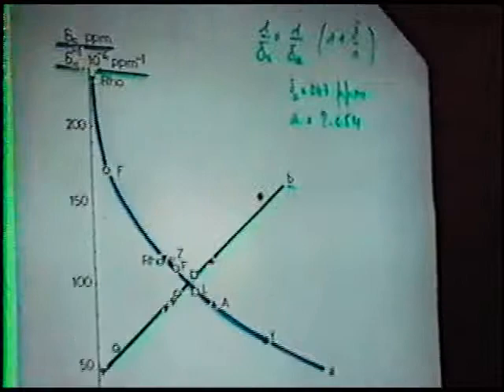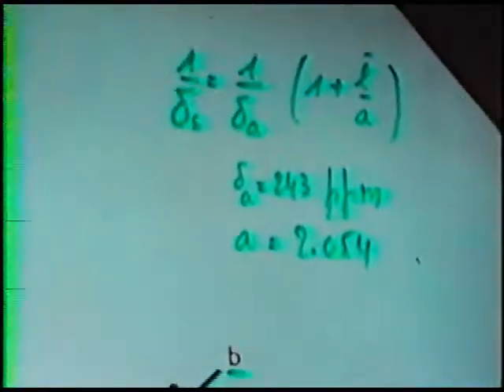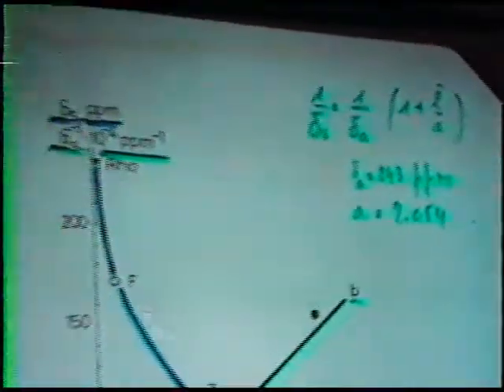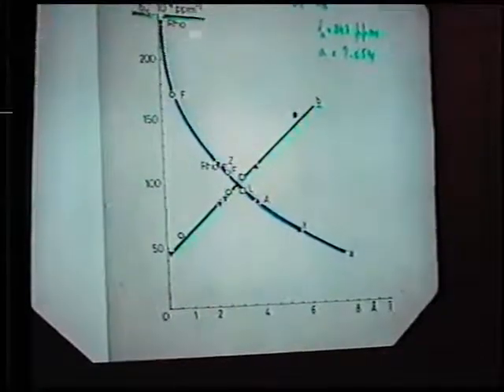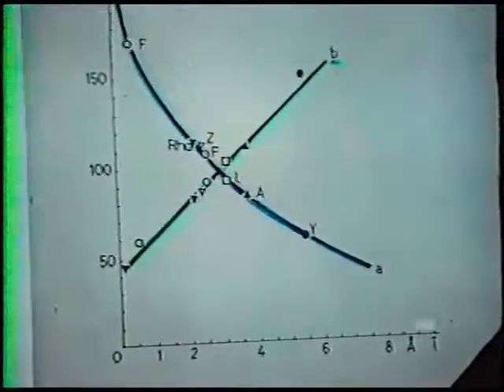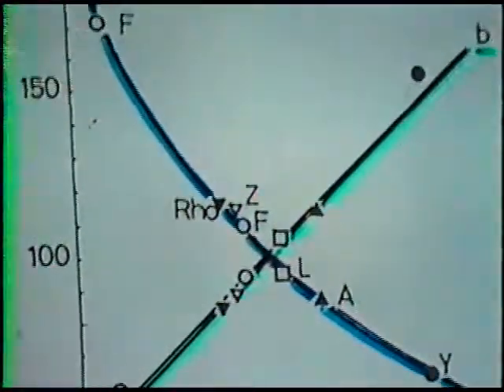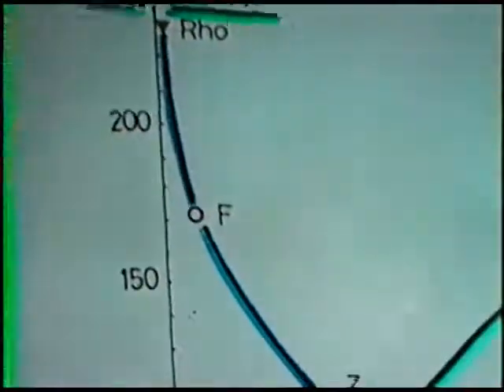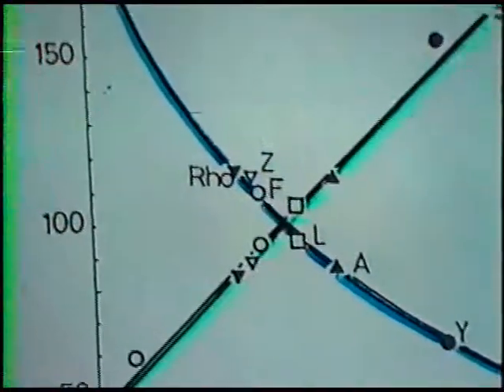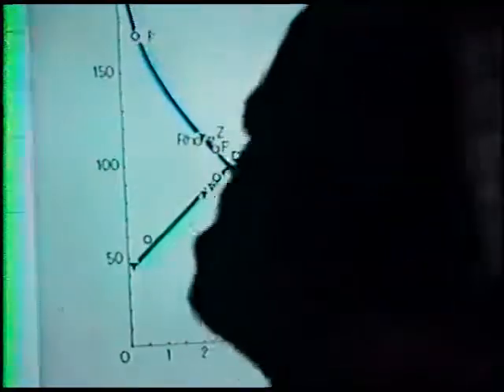And so if you plot now the chemical shift against the mean free path, which is of course directly connected with the structure, we have the blue line. And if you plot the reciprocal value of the chemical shift against the same value, you have this straight line. And now from this straight line, it's possible, knowing the chemical shift of xenon adsorbed in any structure, to determine the mean free path and to determine the size of the zone where xenon is adsorbed.